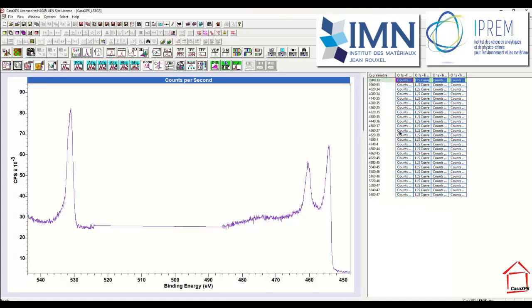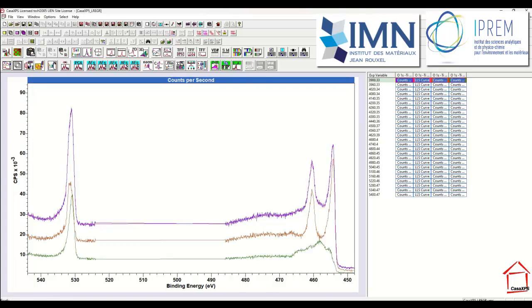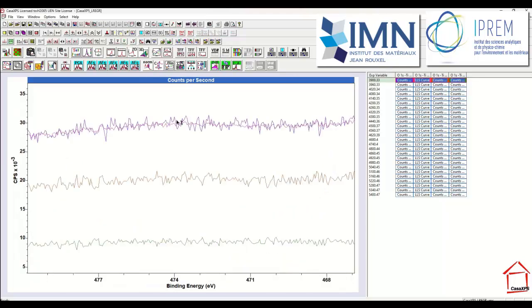There's the original data, the least squares, that's the sum of the different component spectra, two component spectra summed to give the least square solution in the correct proportions. So when I display these overlaid, you can now see the data. It's probably easier to see if I zoom in. That red trace is the least square solution and the blue trace is the original data, and these are the two component spectra in the correct proportions to produce this red trace.